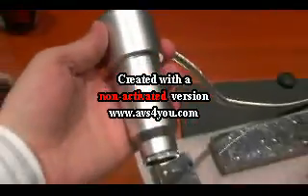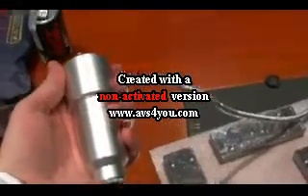This is the microscope itself. It's very small, lightweight, easy to operate, and sturdy.